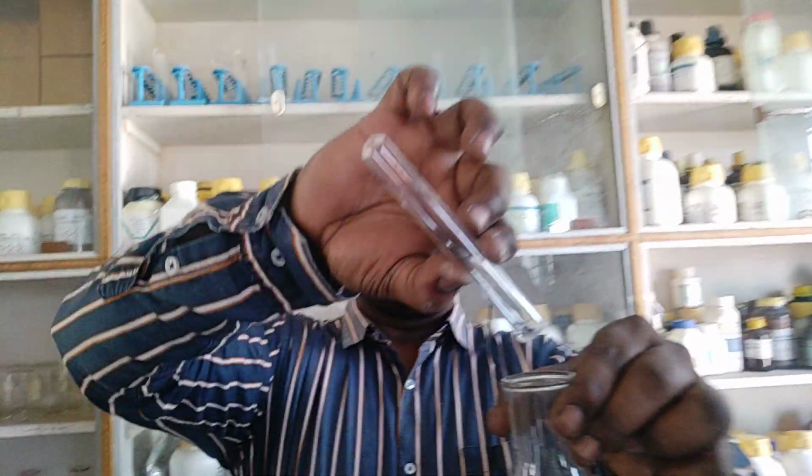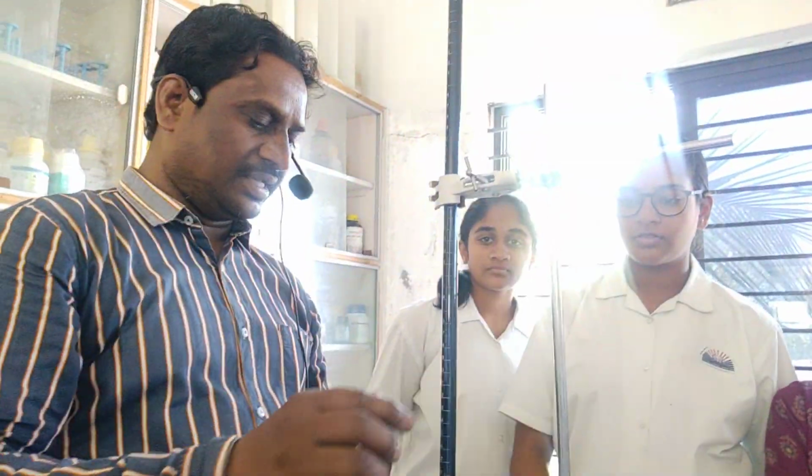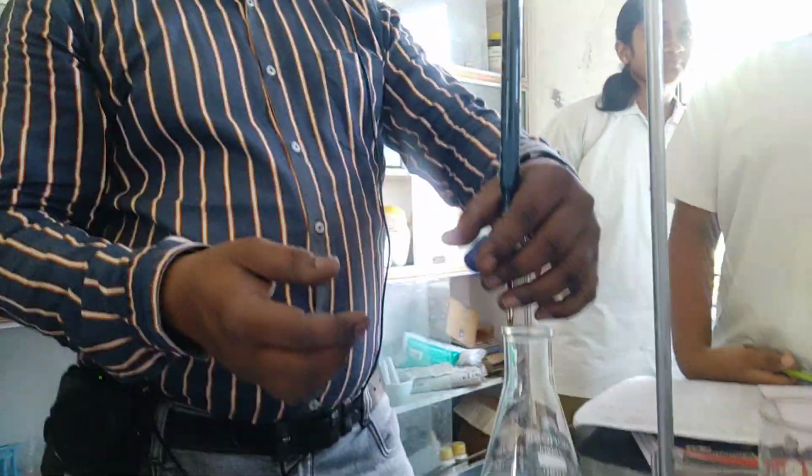Now you have to do titration against what? KMnO4. So this is KMnO4 solution. While doing the experiment, you have to observe readings and release this KMnO4 drop wise. If you release this stopcock very fast, the solution will come down, then it will completely spoil and you have to do it a second time. That's why drop wise.